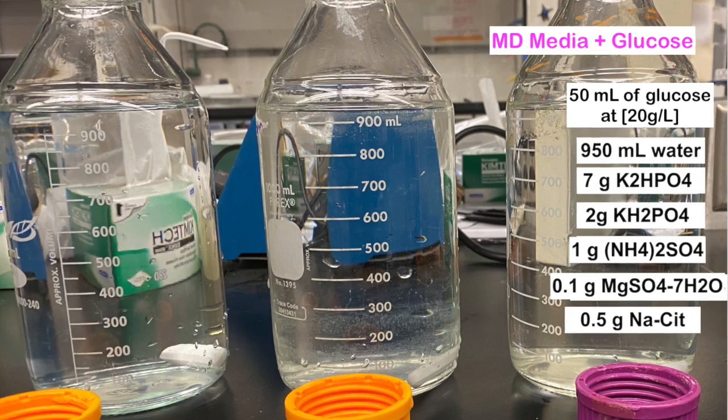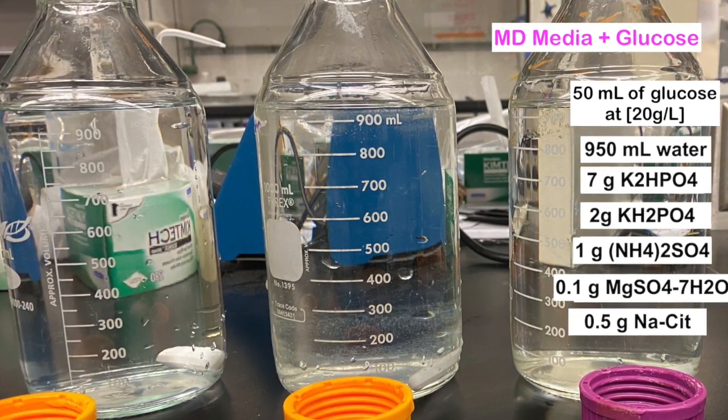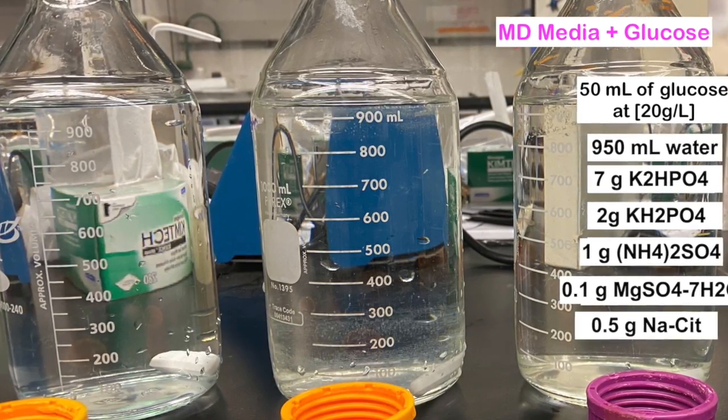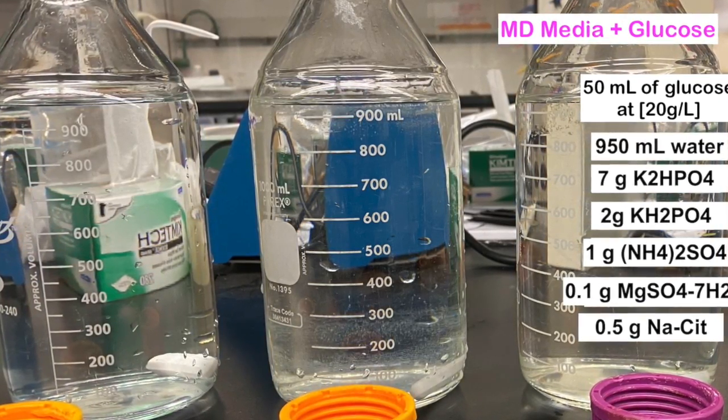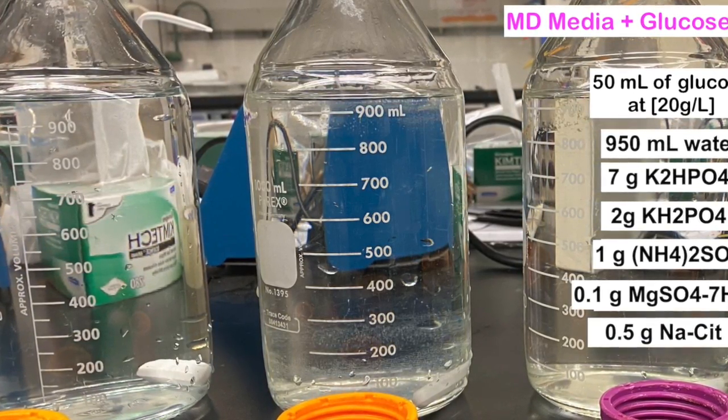The MD media has been sterilized but it is not complete. The ingredient glucose is a sugar and cannot be autoclaved because it will crystallize under high heat. Instead, a glucose solution is filter sterilized at a concentration of 20 grams per liter and then added to the MD media.